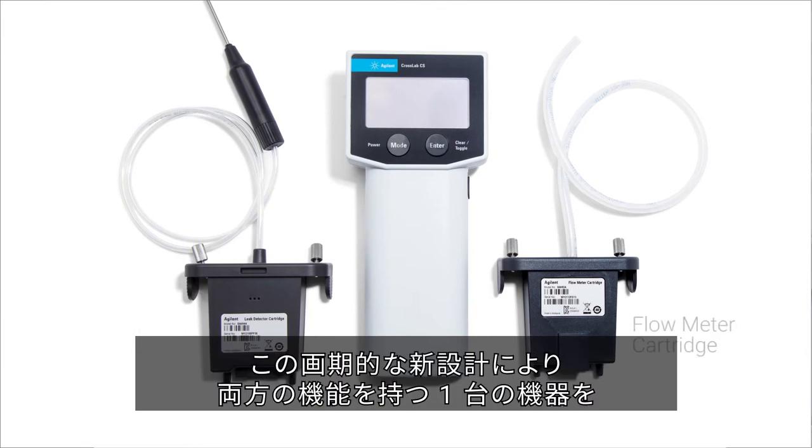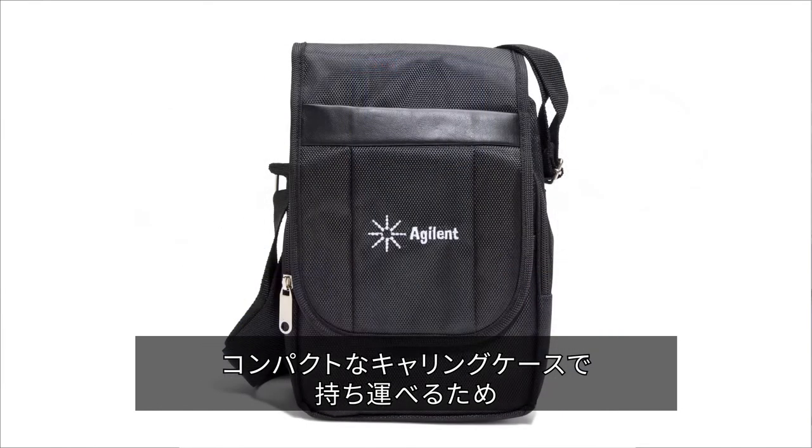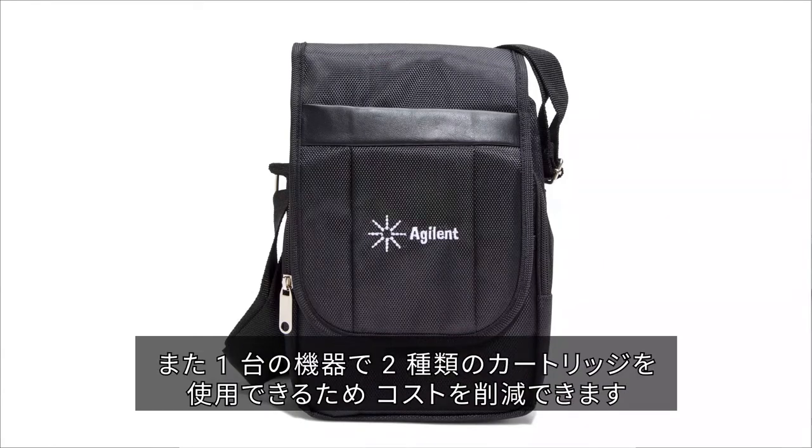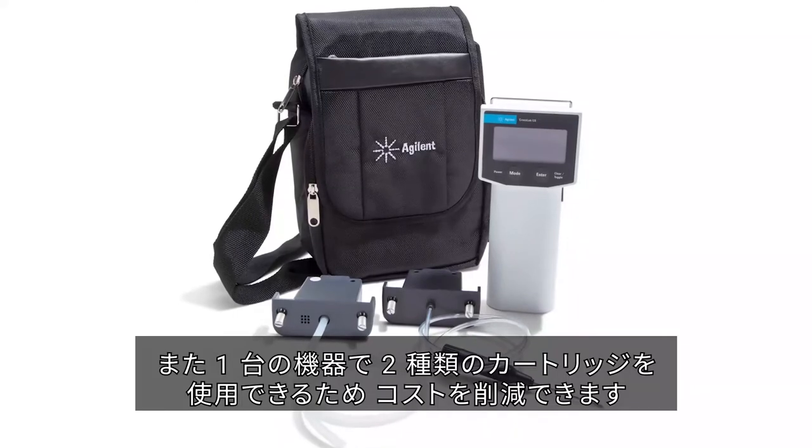This innovative new design helps save space by allowing the user to carry both devices in a compact carrying case, and save money by allowing the user to purchase a single handheld with two economical cartridges.